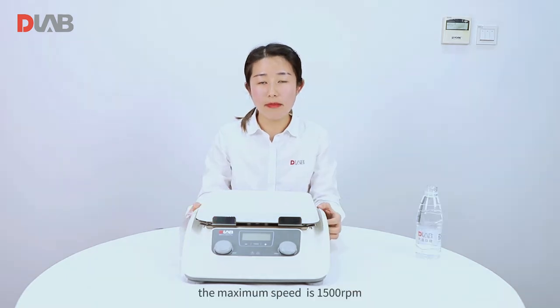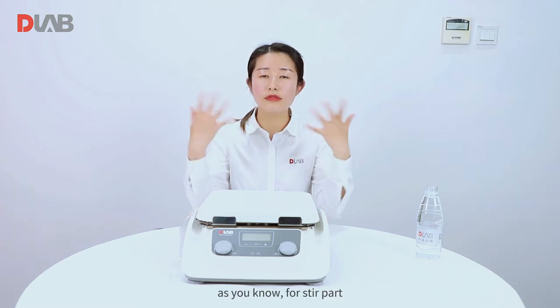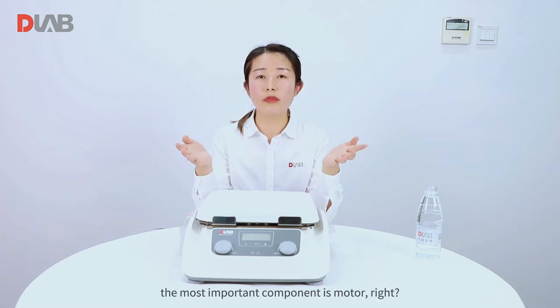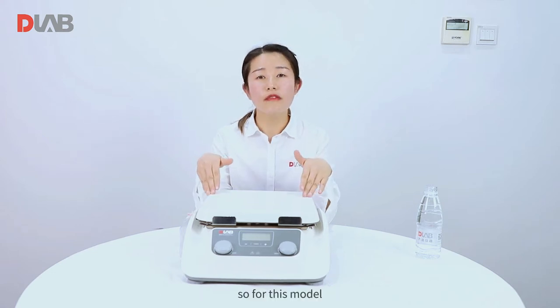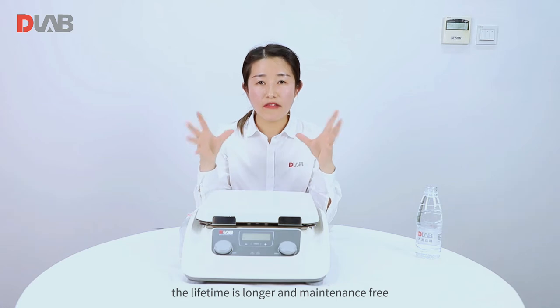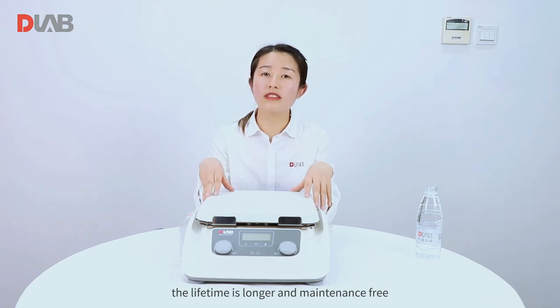For the stirring part, the maximum speed is 1500 RPM. As you know, for the stirring part, the most important component is the motor. For this model, we use a DC brushless motor, so the lifetime is longer and it is maintenance-free.